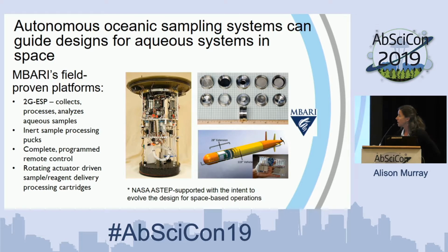MBARI has a lot of history and experience in operating remote autonomous platforms in the ocean on Earth. This is the 2G ESP that was originally funded by a NASA A-STEP project, with the concept that they would evolve this design into space-based operations. The 2G ESP here is very large, but this is actually a functional molecular biology platform, where it's not only collecting samples and processing and analyzing them, but also doing real molecular biology, DNA extractions, PCR, and remotely communicating that information back to the lab.